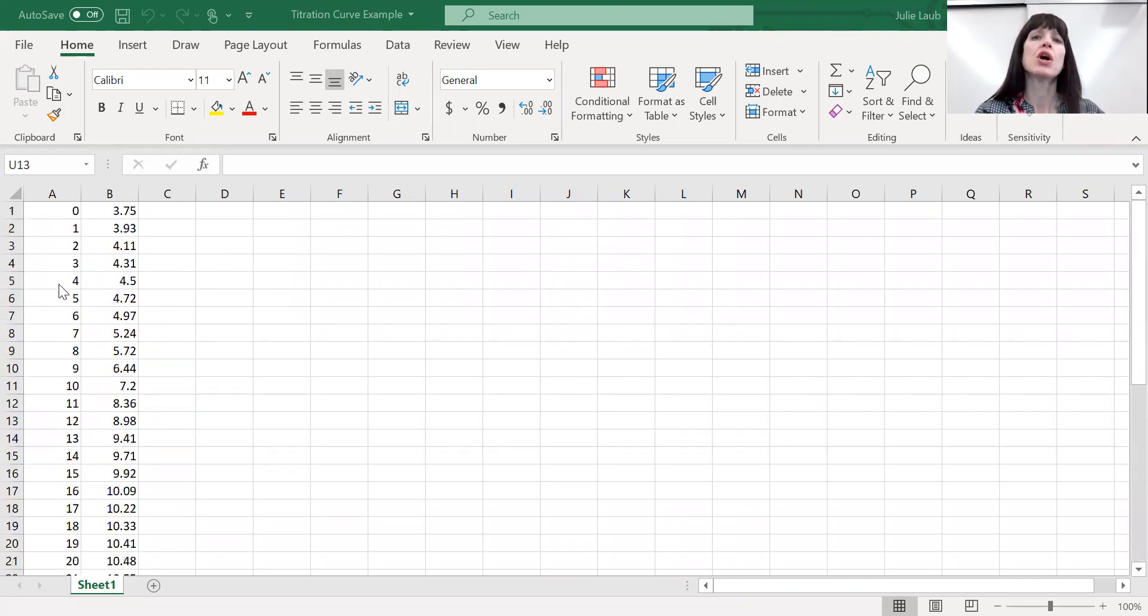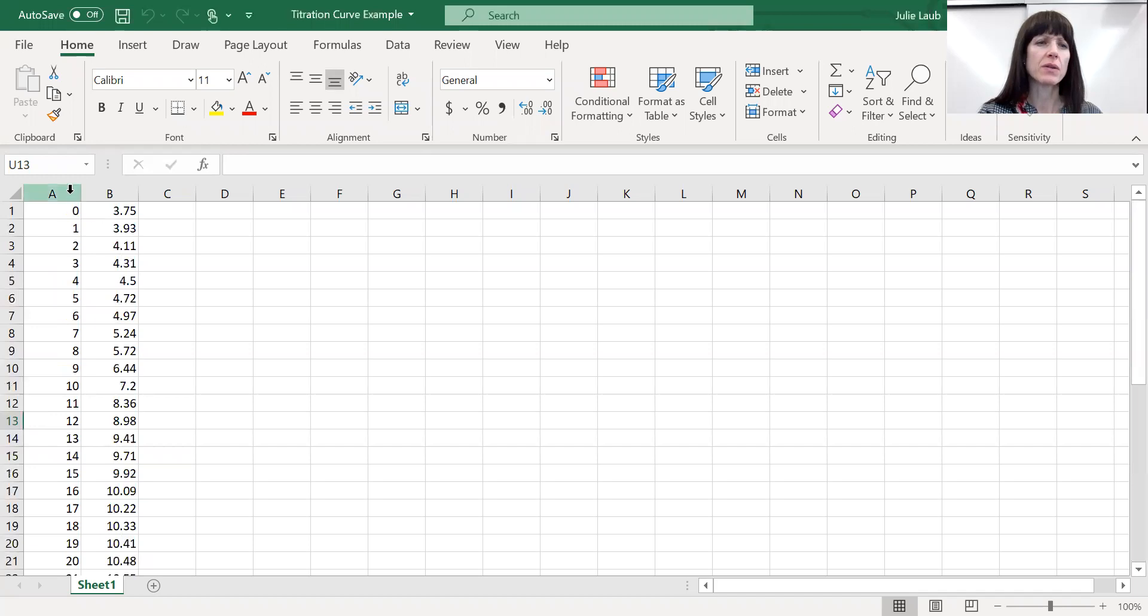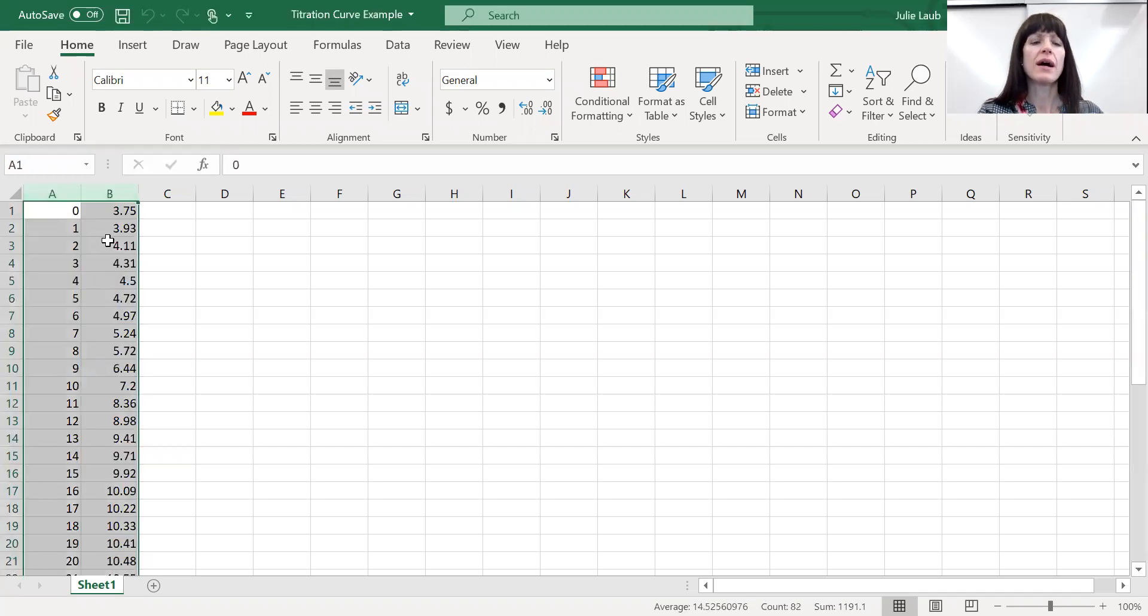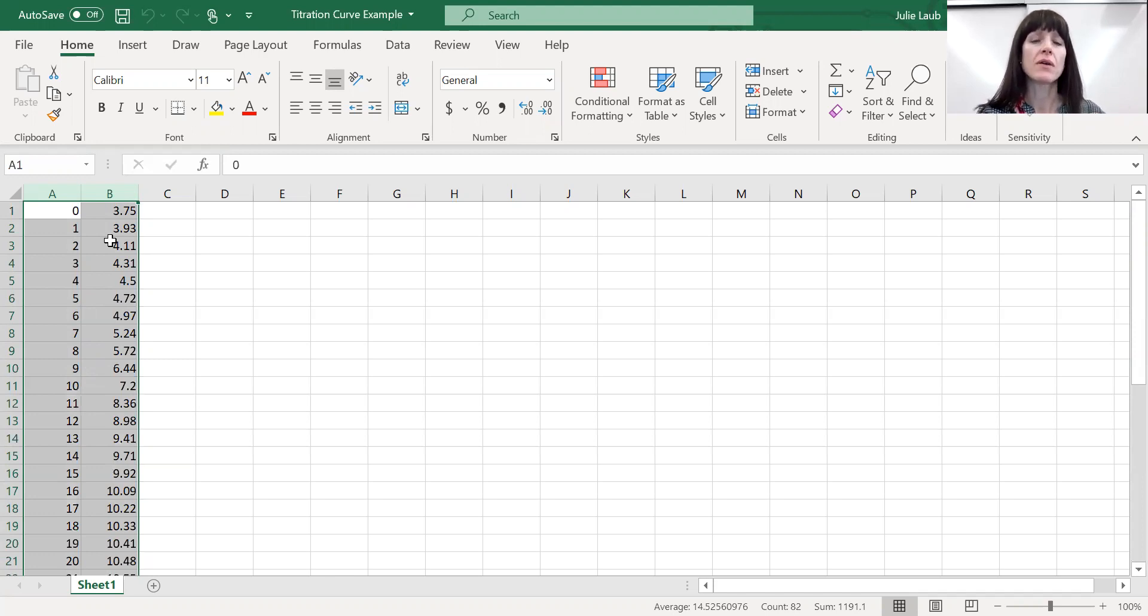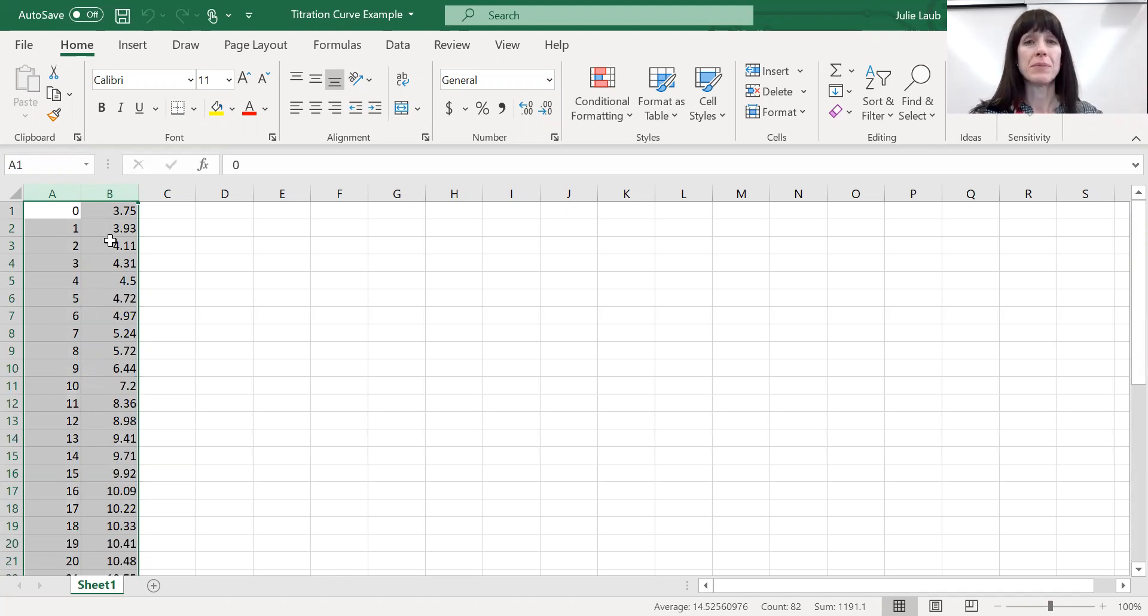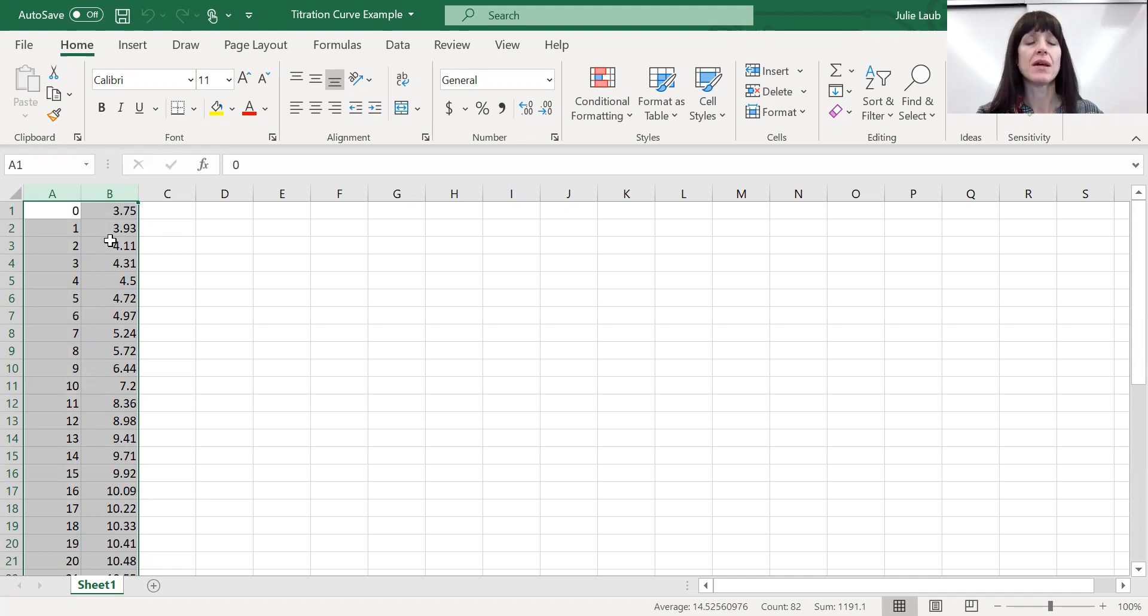And then for each mil, we recorded the pH. So you can see all of these pH values. What you're going to do is highlight both of these so that you have your y-axis and the x-axis. Now the y-axis is going to be the pH. So you can see the first column has to be your x-axis mils. The second column has to be your pH, which is going to be that B column. That's the y-axis.